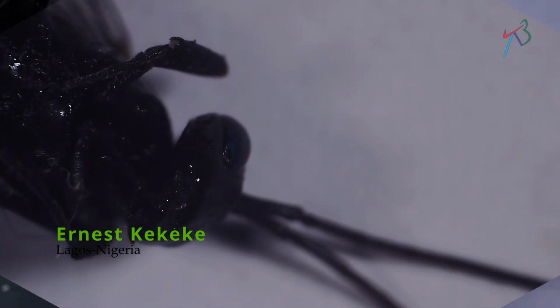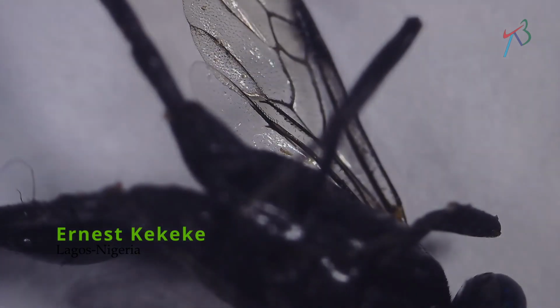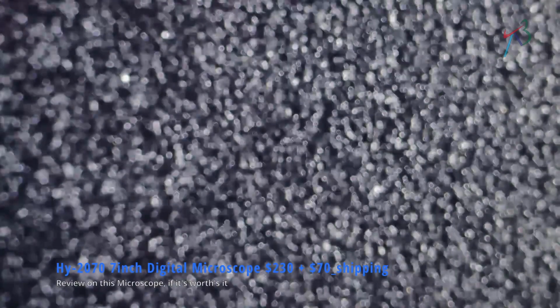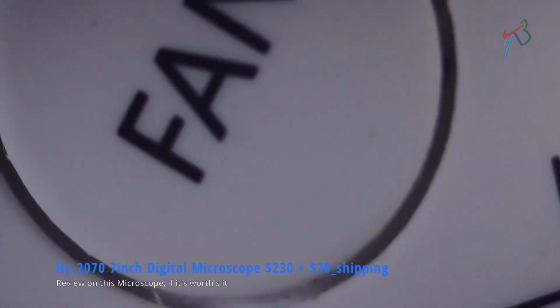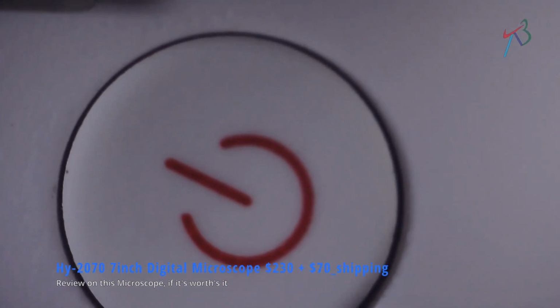Microscopes come in different forms. We have the simple microscope, which is just like an advanced form of a magnifying glass. We have a stereo microscope. It allows you to see very, very small objects, and it gives you the details of the object. These are microscopes that are used basically by, if you're into engineering like me, we use this microscope a lot.